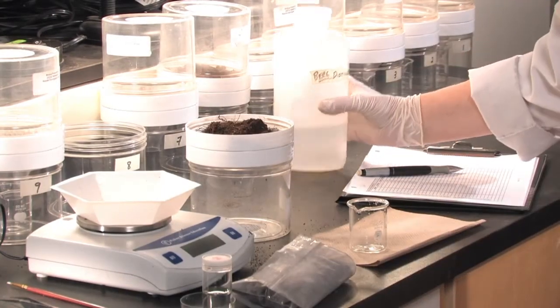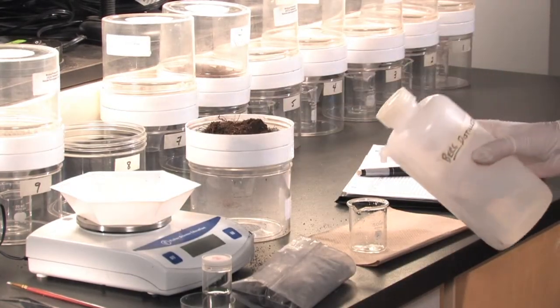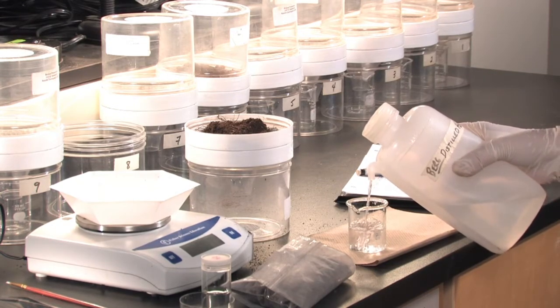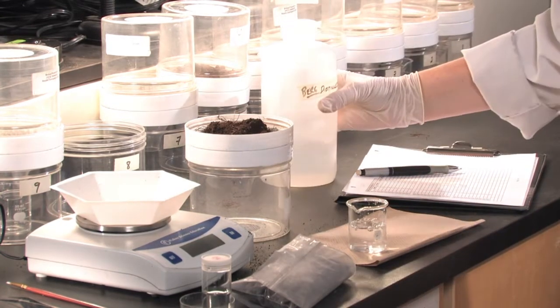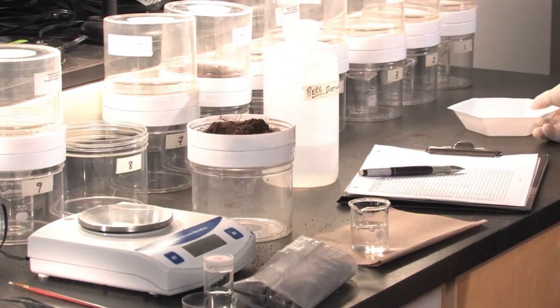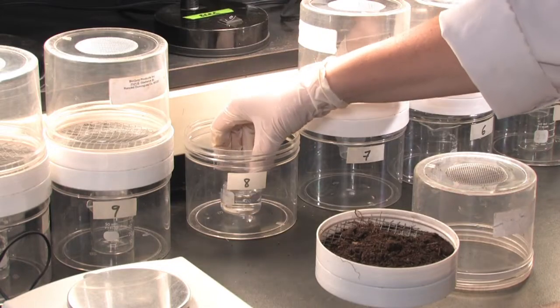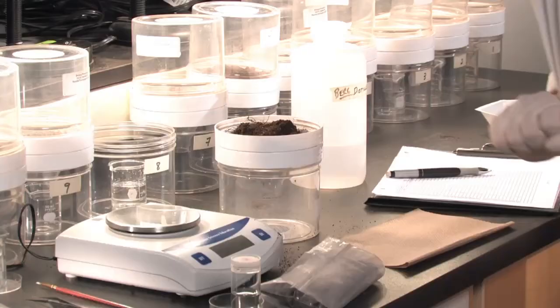Now we fill a 50 milliliter beaker with 20 to 25 milliliters of distilled water. This is used to catch the microarthropods coming down the tunnel. This is placed carefully in the bottom of the extractor.